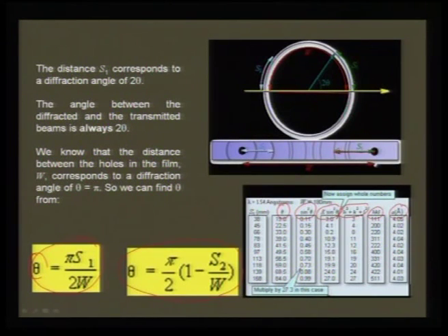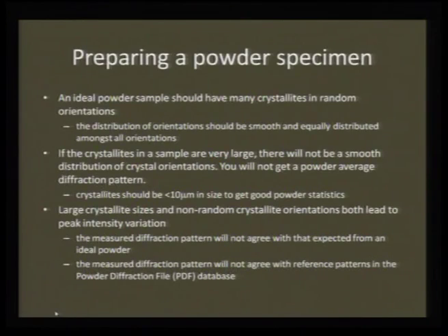So, this is the earlier version by which X-ray diffractions were made, and those were available only as photographic film. So, you need to take an X-ray photograph, and then you develop it and calculate the distance from the central spot, and that is how you measure the interplanar spacings. But today this is all simplified, and you can get everything in a single fashion.